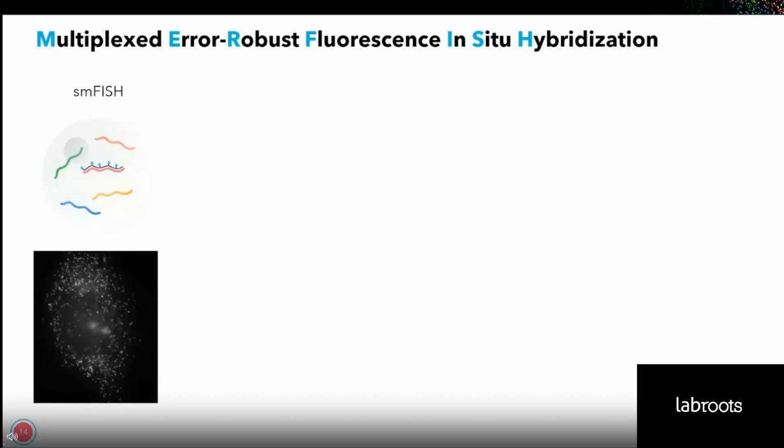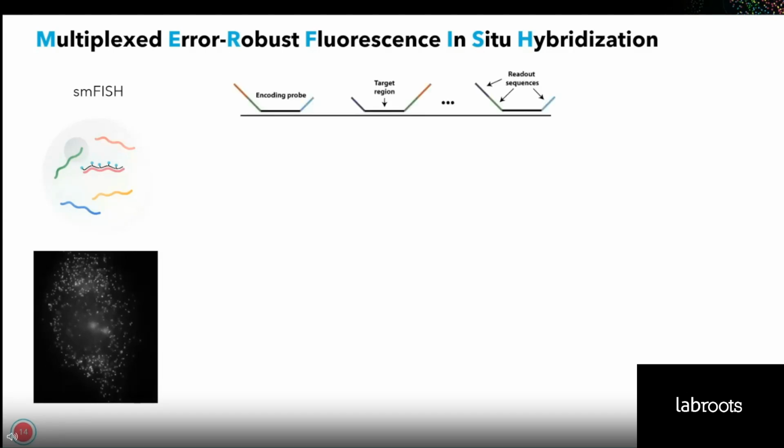To achieve highly multiplexed RNA detection in the MERFISH design, each gene to be detected is assigned a unique barcode such as 100110000. The encoding probes, without fluorescent signal, are first hybridized to the RNA targets, with probes targeting different RNA species having a handle that could be bound by a secondary readout probe.